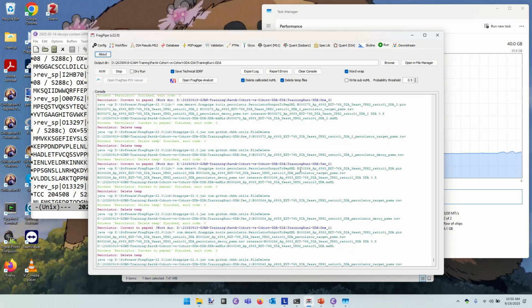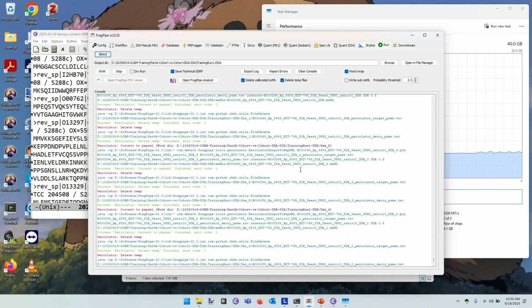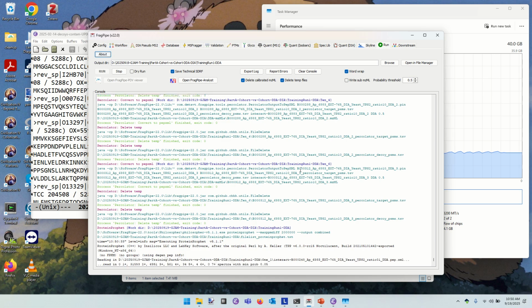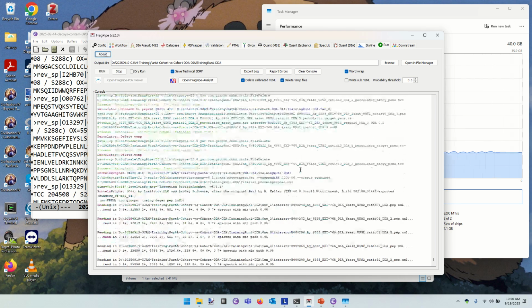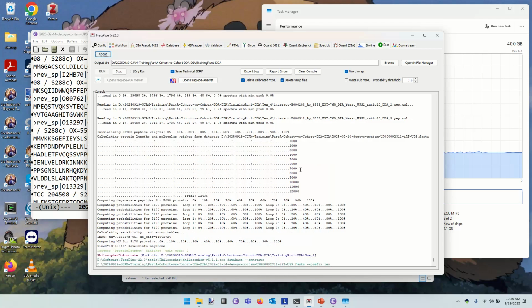You may even have multiple spectra identified for a given peptide within the same experiment. At present, the way that most people in the proteomics field deal with identification, they assume that each MS spectrum should be evaluated independently. So seeing other spectra for the same peptide gives that peptide no advantage in identification for a given spectrum.